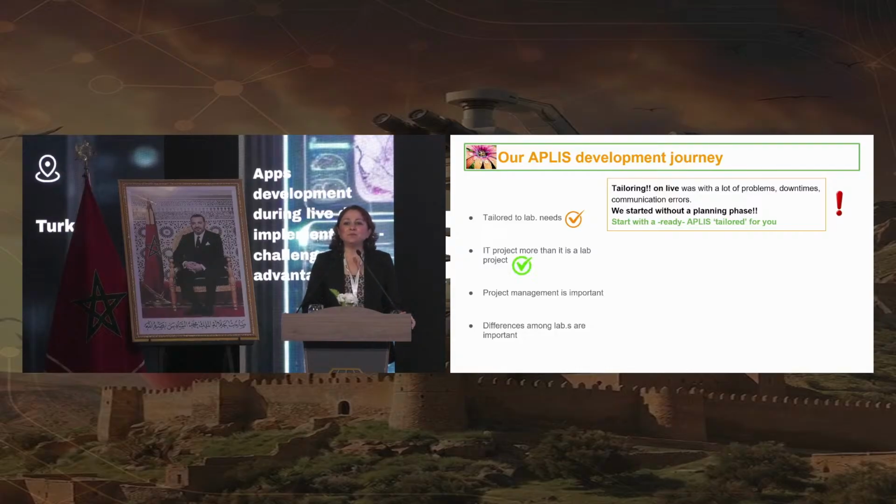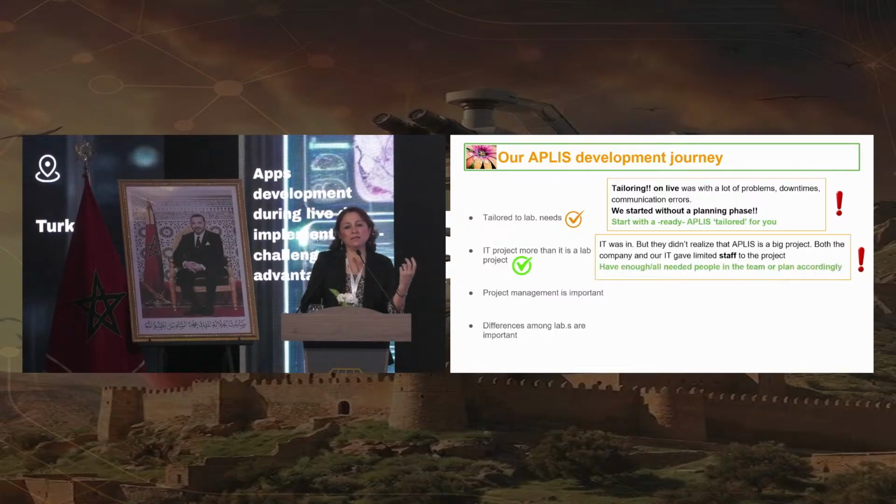Then, it is an IT project more than a lab project, don't forget that, and involve IT people. What we had, and what we would do differently if needed, is that the IT team was in, but both the vendor and the IT team were not aware that APLIS is a big project. So for 2 years we had only one coder, and things take a lot of time to develop.